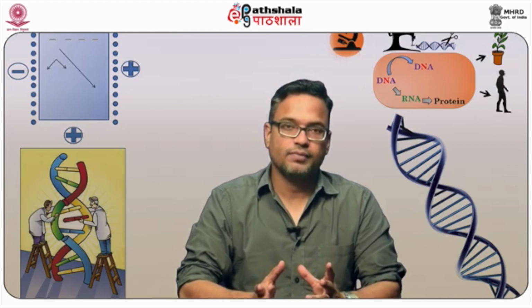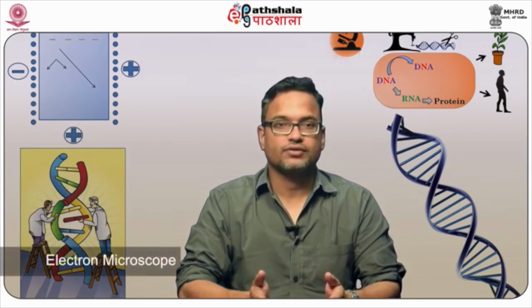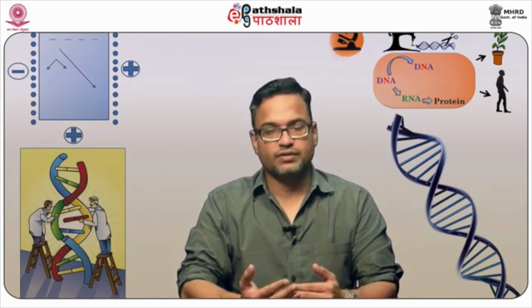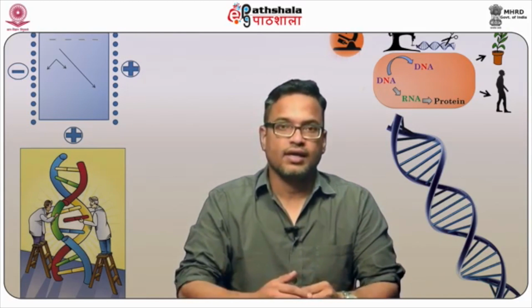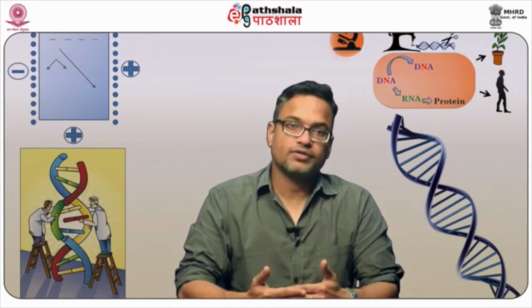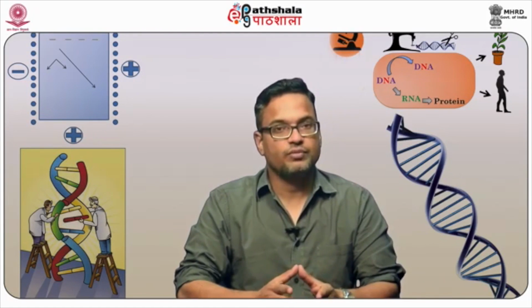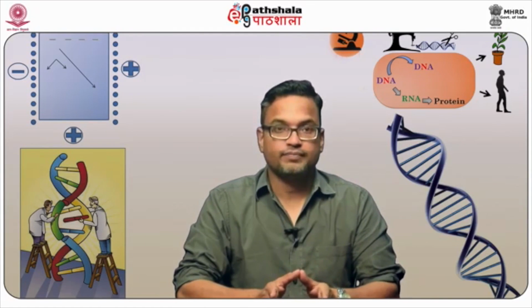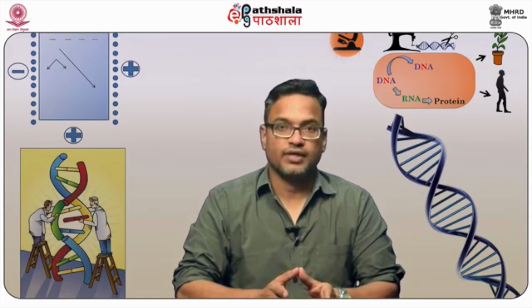Okay, so for the types of microscope, as we mentioned earlier, there are 2 different kinds of microscope here: the electron microscope and the scanning probe microscope. These 2 microscopes are very different from the ones we discussed earlier, and will be discussed in detail in a separate next module as well. So the electron microscope basically utilizes an electron beam as a source of illumination compared to a light source or UV light, and they have 2 variants, either the transmission electron microscope or the scanning electron microscope.